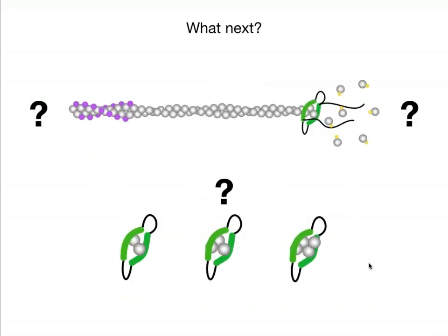Now, bare actin, of course, is fairly boring if the goal is to understand how actin polymerization works in cells, and you would like to look at how this process is actually regulated by actin binding proteins. But the basic assay systems that we've developed for bare actin can directly be applied and used to investigate the mechanism by which actin binding partners influence this process.